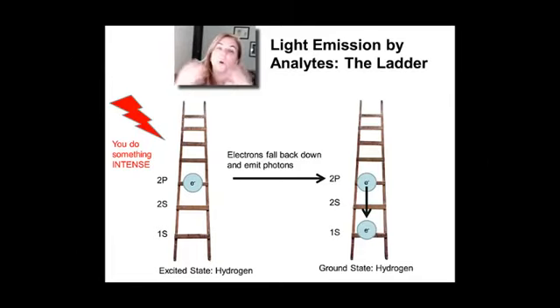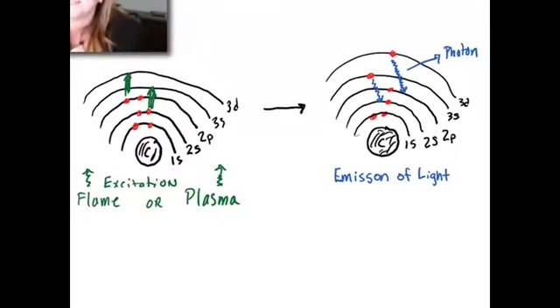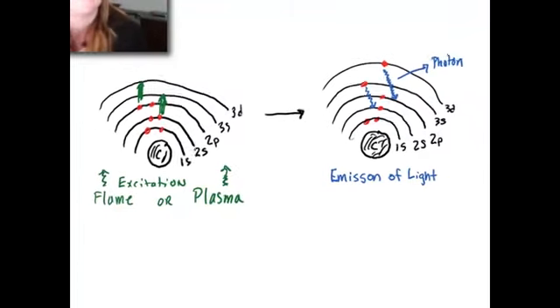And that's happening because you're putting them up into an excited state and they're falling back down into the ground state. And it's kind of like you don't have enough energy to always get them up into that excited state. So just as you're putting them back up, some are falling down, you're putting them back up, and some are falling down. And so that's what you're really doing when you're doing these experiments, is you're detecting the photons that come out. Now, what's really important about the photons that come out is you can see here the green light is getting absorbed, and that's going to be excitation that's not light. It's going to be thermal, it's going to be electrical, something to get atoms excited. Once they're excited, then they return to the ground state and they emit photons of very different energies.